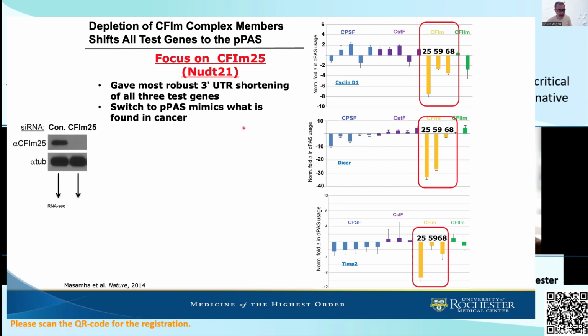So the main question we had was, what are all the RNAs that are targeted by this RNA binding protein? That's a question for RNA sequencing. And again, if you look at the date, this is going back 10, 12 years ago, in the earlier days of RNA sequencing.